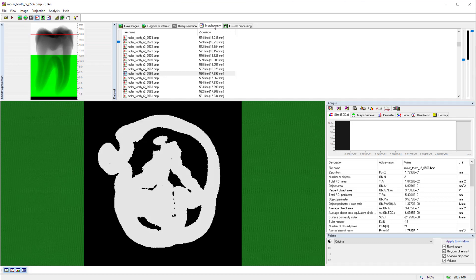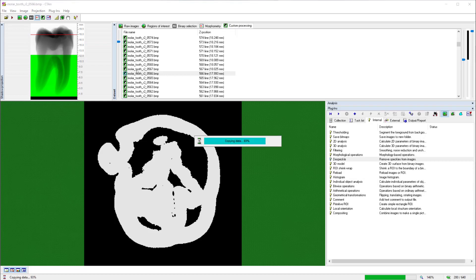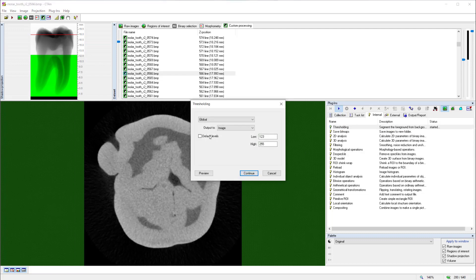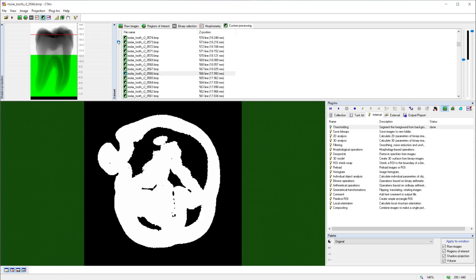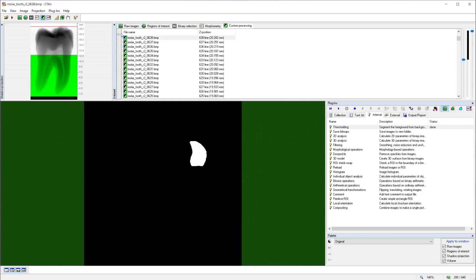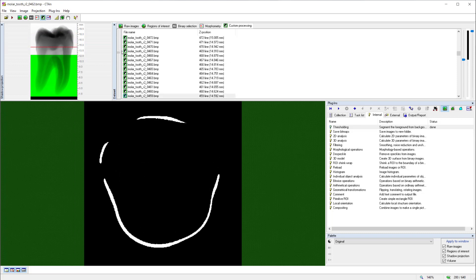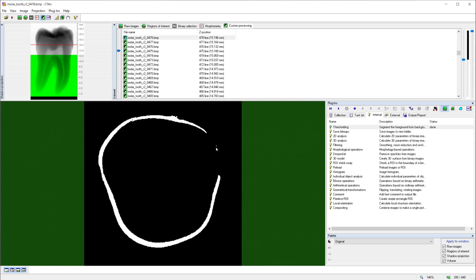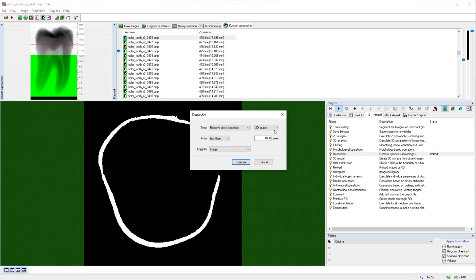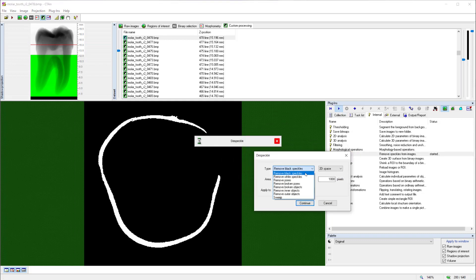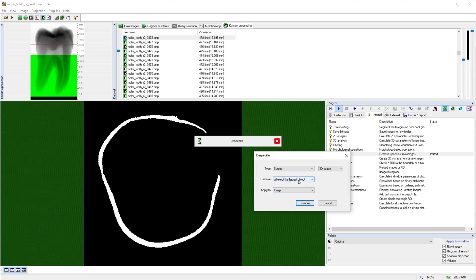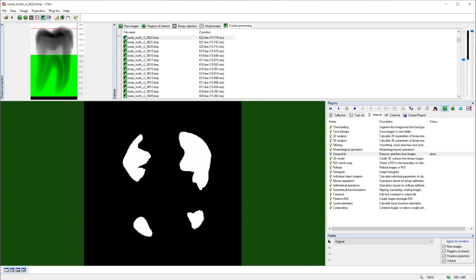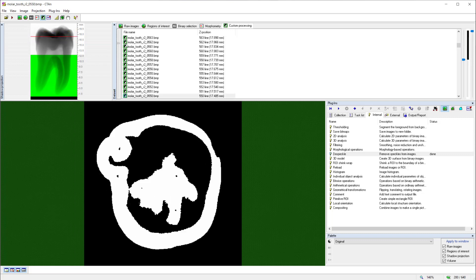Now we could make measurements at the morphometry page, but in this case we will move on to the custom processing page. And we will apply the same threshold by clicking Thresholding and Run and applying a threshold value of 124 to 255. Now at various cross-section levels, we might find disconnected binarized objects that we would prefer to exclude from our measurement. And the function Despecle allows us to do this. I can run Despecle, and I can choose the function Sweep, and I can set it in 3D space to remove everything except the largest connected object. In this case, disconnected objects will disappear. I can safely use this extreme form of Despecle here because the enamel is all connected as a single object.